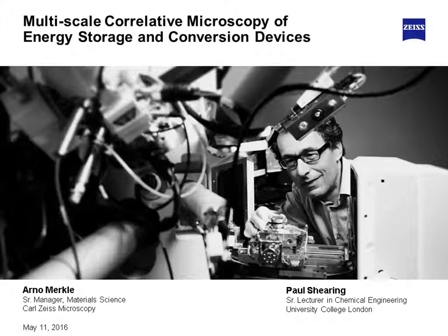So the thing that I think we're most excited about is really spanning all of those length scales from nanometers through to millimeters. There are challenges with the instrumentation, and challenges with the data management for all of those things. At the moment, we are collecting in our lab in the order of tens of gigabytes of X-ray images a week.